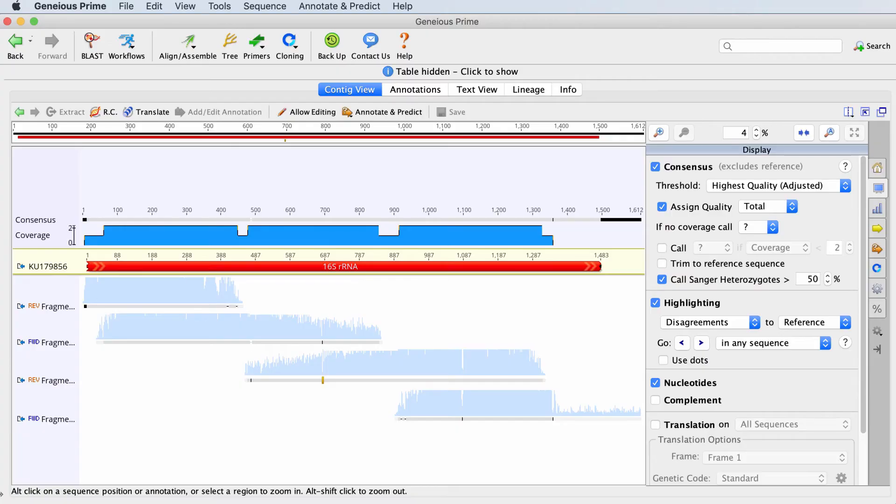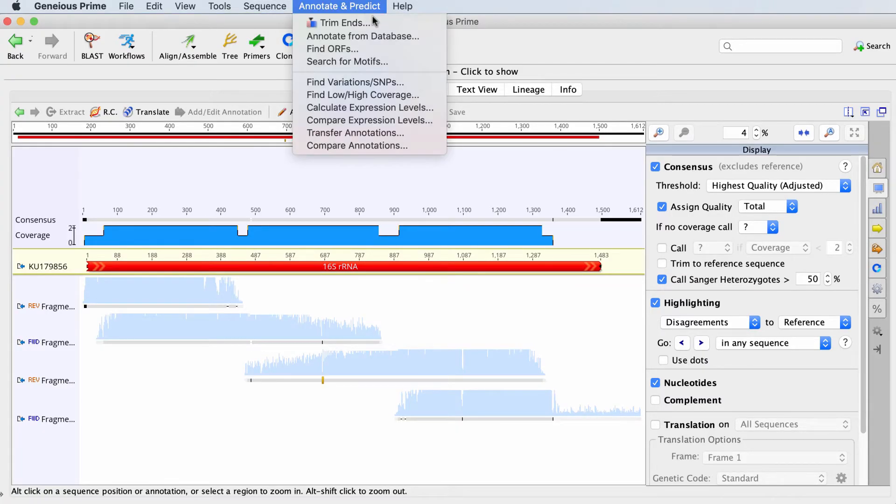Select the contig document and go to Annotate and Predict, Find Variations and Snips.